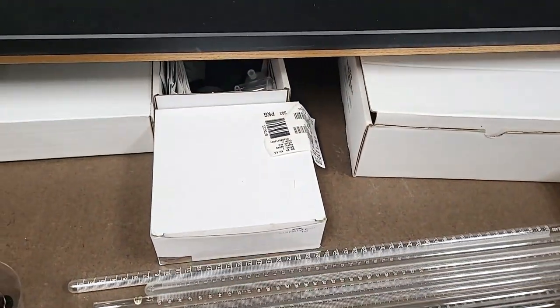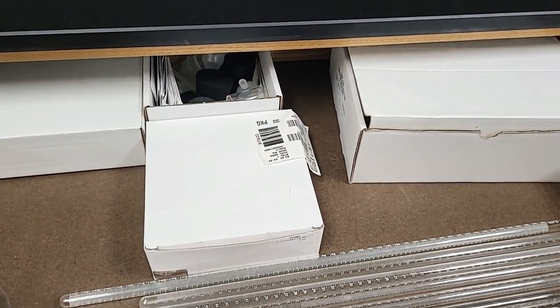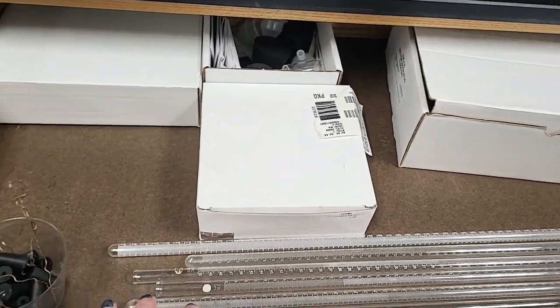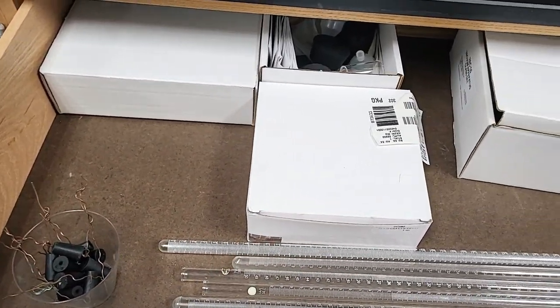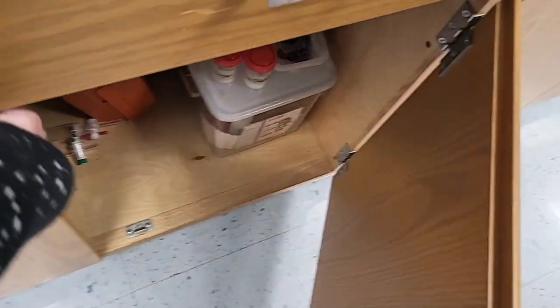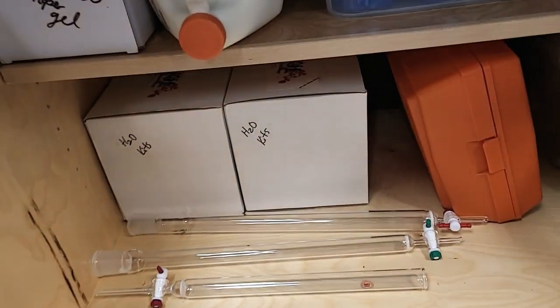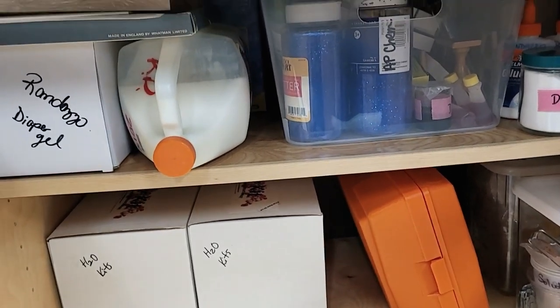Over here, this is all my gas stuff. So I've got, for example, my eudiometers, and I've got pressure gauges. I've got my copper wire to hold the magnesium. And then down here, it made sense to me to put intermolecular forces. So I also have some intermolecular forces stuff here.